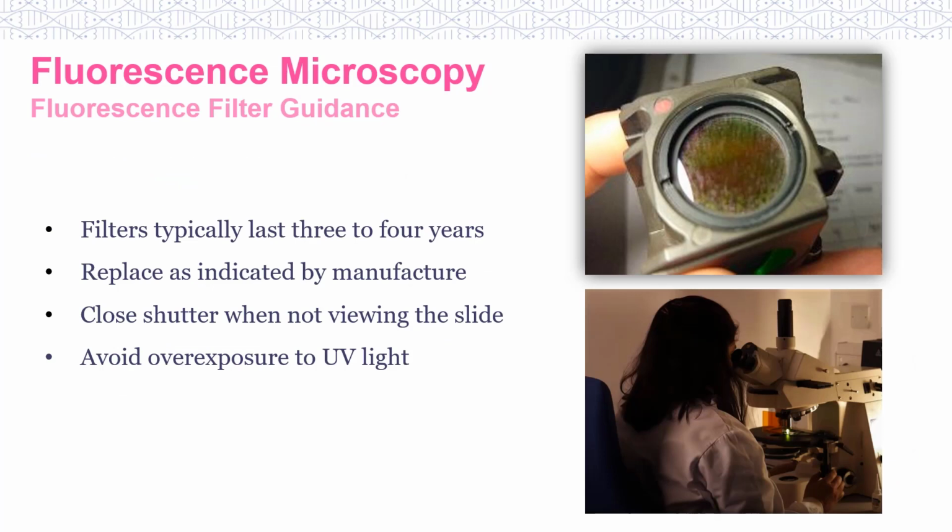Also, remember that filters are considered laboratory consumables. While replacing older filters is recommended every 3 to 4 years, some newer filters are designed with a sputter coating that extends their lifetime. It is always recommended to replace your filters as designated by their manufacturer. Your laboratory may wish to assign one of your laboratory technologists to perform maintenance and check filters periodically for wear and tear, or have them checked by qualified personnel as part of your microscope's preventative maintenance program.